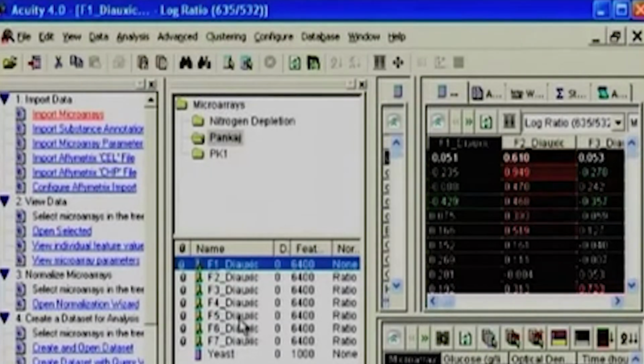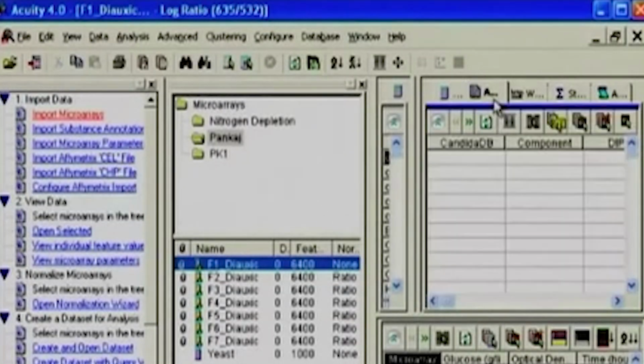Correct. And this is a good point you raised, because a very important next step is substance annotation. The substance here I mean is each spot, which could be the feature, which again could be an RNA or a gene or a protein. That is why we call it substance annotation. Very few people extensively trace them. So here I'll show you in the form of the tab data in the annotation.